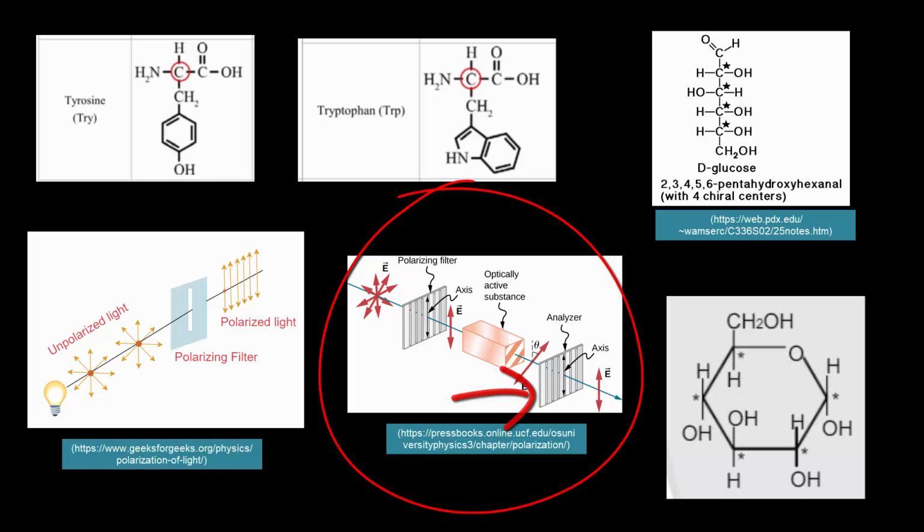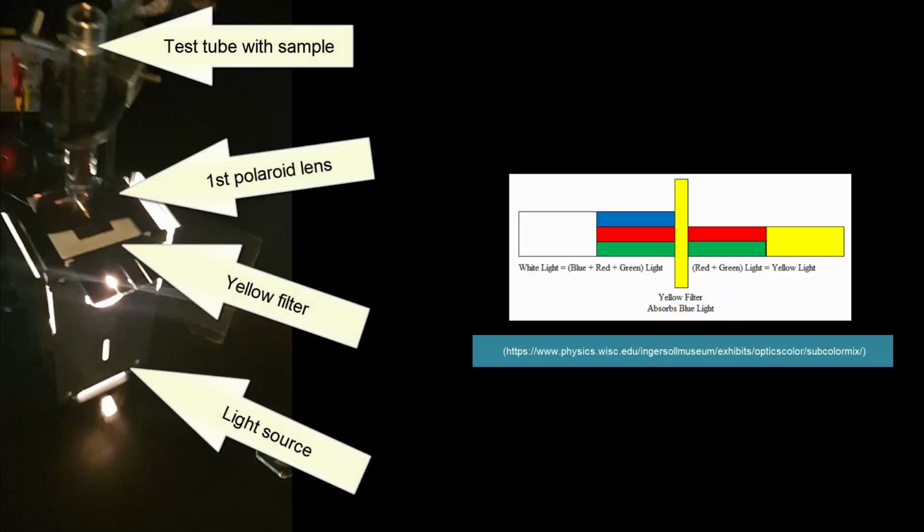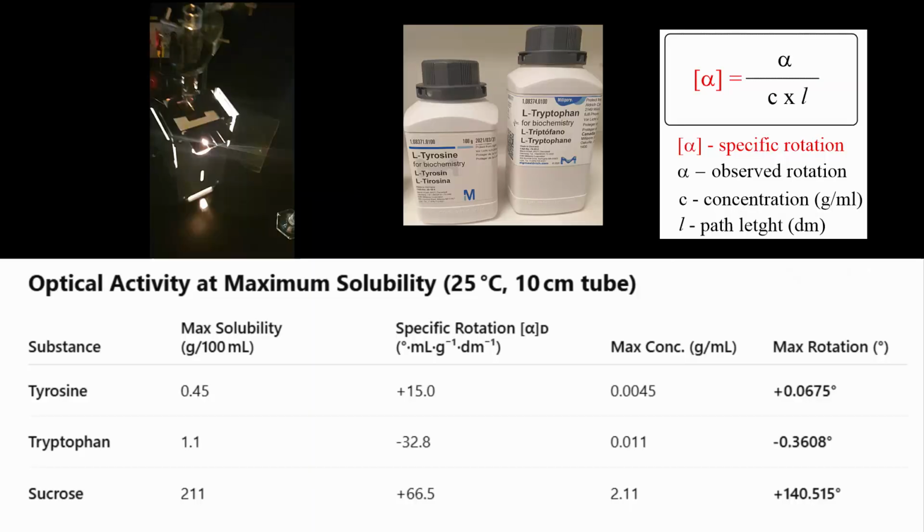Okay, so going to the second setup, the initial setup wasn't working that well, and so I looked up what's more ideal, and they said shorter wavelengths don't turn as well, so use a yellow filter. A yellow filter contains green and red, so I threw a filter in there, and I grabbed just my sunglass lens.